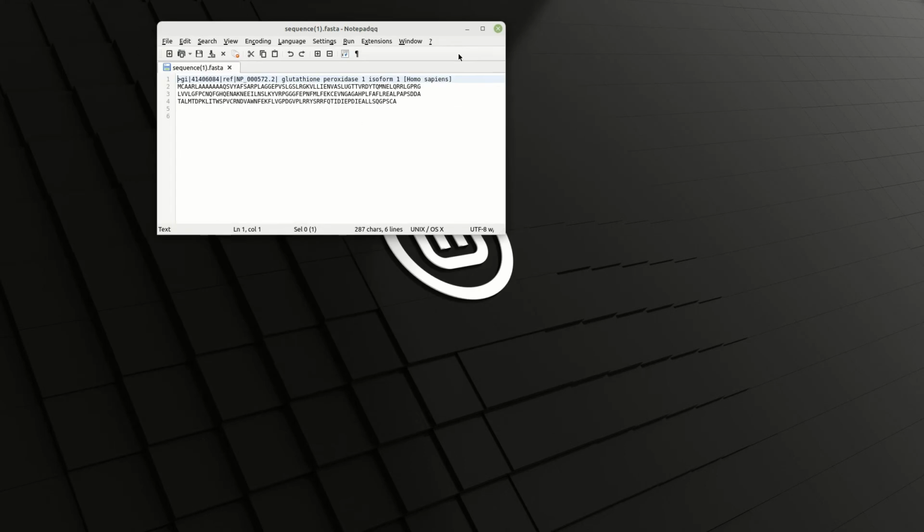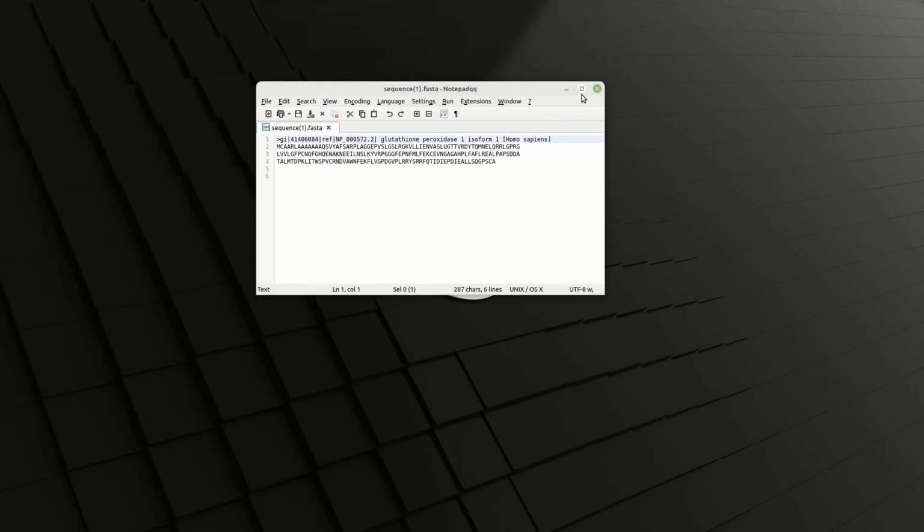Yes. There we go. So what I want to look for in this sequence, as in this assignment, is your start and stop codons. And so start and stop codons, well, they're going to start up here and back here.